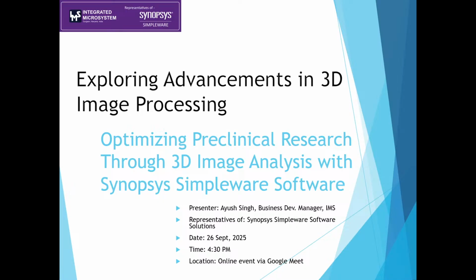We have the foremost issue of noise generation. There are a lot of noises present in the data set that generally tend not to go away when we are doing the segmentation, which may cause delay in doing the segmentation and various other issues.